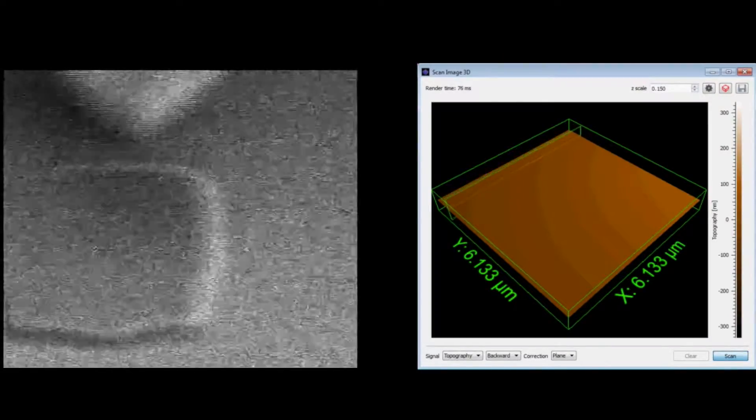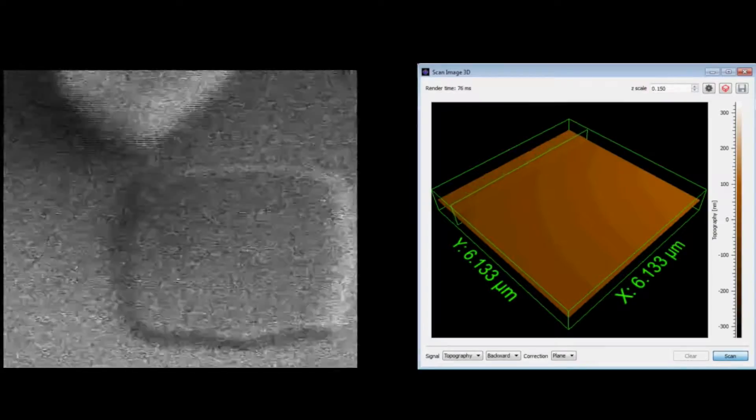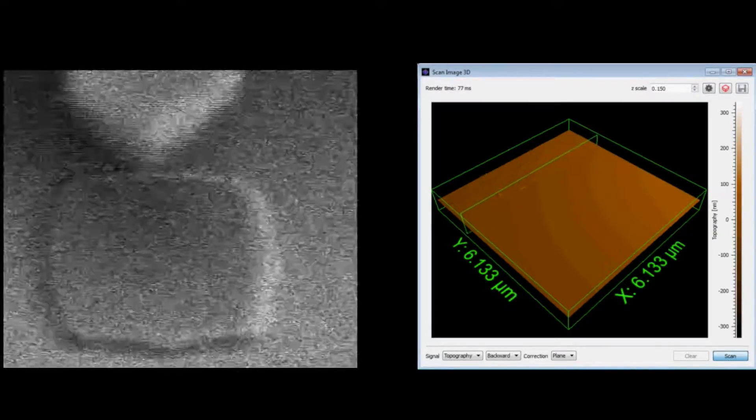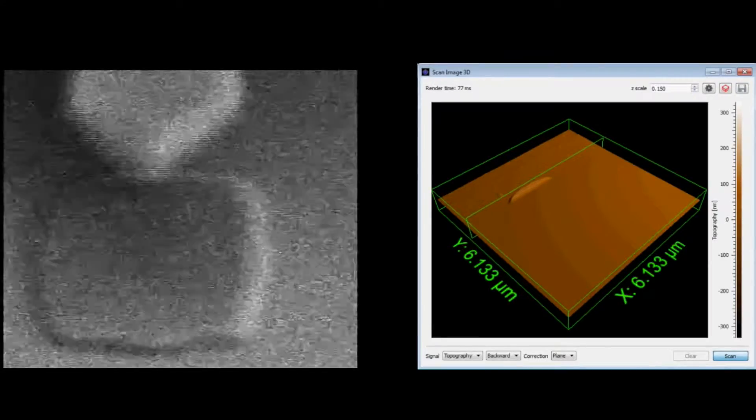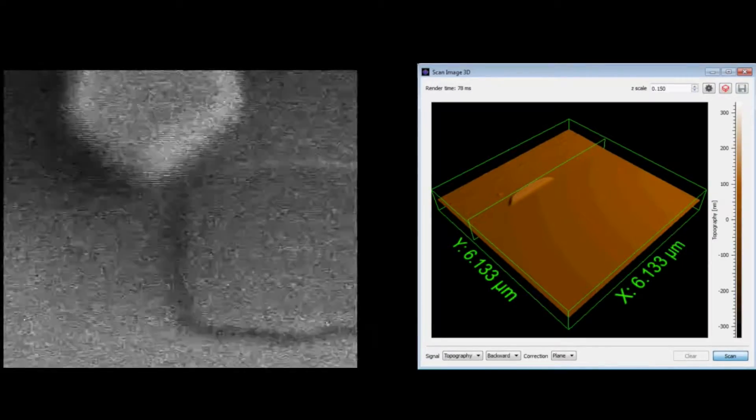Active cantilever technology utilizes the fact that the readout bending sensor and thermomechanical actuator are under the cantilever. This combination makes AFM and SEM investigations possible simultaneously.